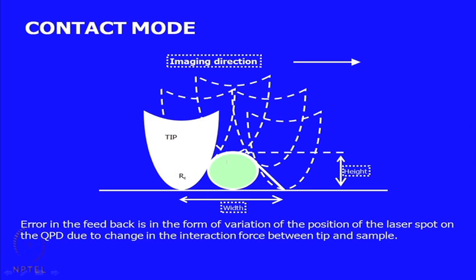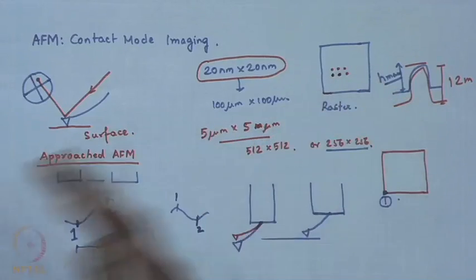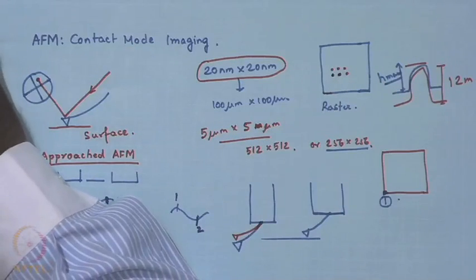So, here comes the tip, you have a feature height. It goes up and then eventually comes down, and consequently you also understand that at every scan location, every time it moves from one rastering point to the next rastering point, it actually undergoes two intermediate steps.